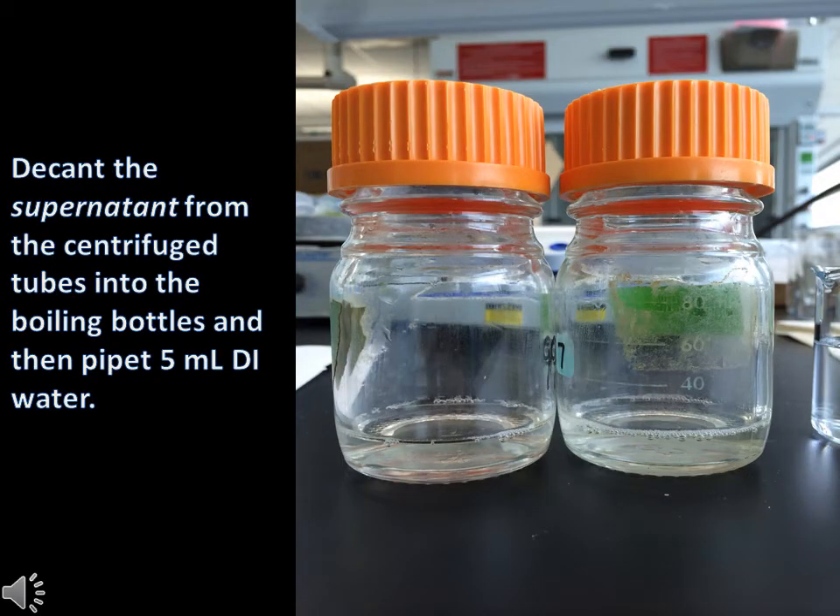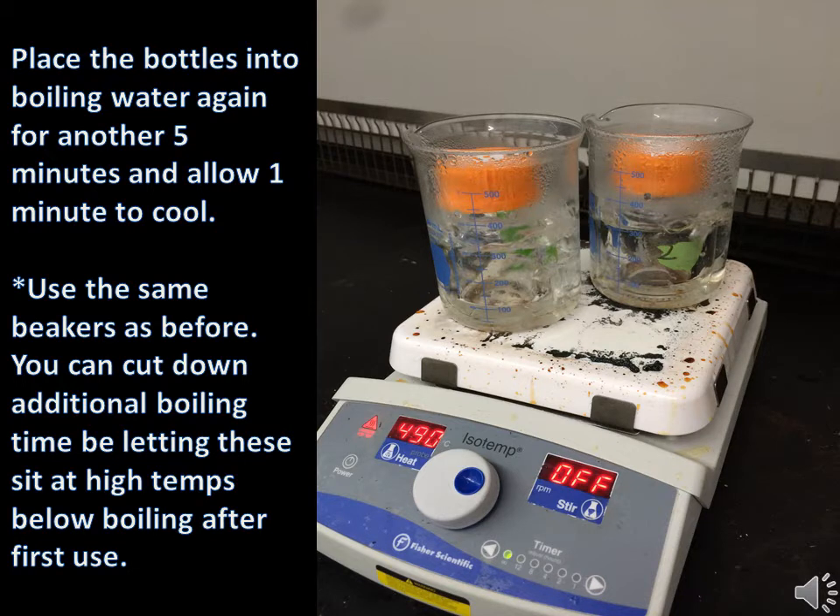Carefully decant the supernatant from the centrifuge tubes into clean bottles, then pipet 5ml of DI water into each bottle. Place the bottles filled with supernatant back into the boiling water bath for another 5 minutes, and 1 minute to cool after you have removed them. You can save time at this step by keeping the beakers filled with water hot in between boiling periods.